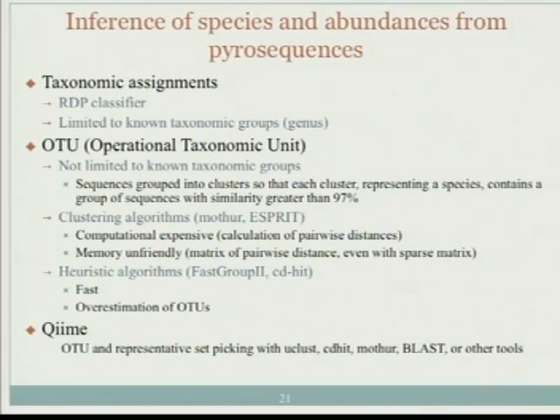If you have so many reads, you cannot even do average linkage clustering. For the HMP project, there are so many reads that probably only one or two groups could do that, using a supercomputer, so that they could run all the pairwise alignments and load in the pairwise distance matrix to do clustering.